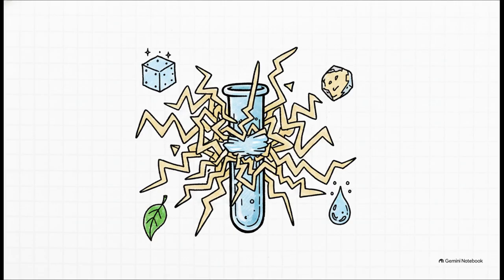And during all that prep and analysis, the sample's matrix gets in the way. The matrix is basically all the other stuff in your sample. The salts, the acidity, the organics, the particulates. These can introduce overlapping spectral lines, which is a fancy way of saying the machine confuses one element for another, or chemical interferences that suppress the signal entirely. If these matrix interferences aren't properly accounted for by the lab, they will absolutely create completely false readings.